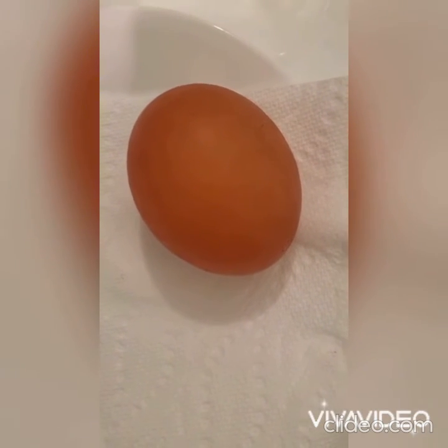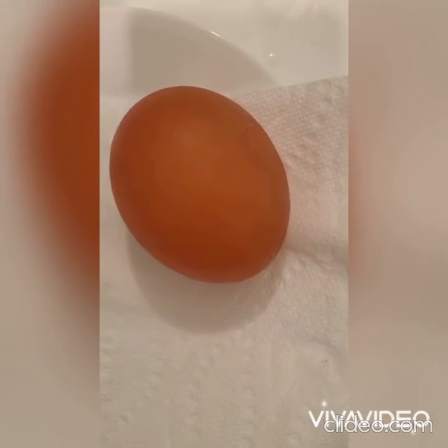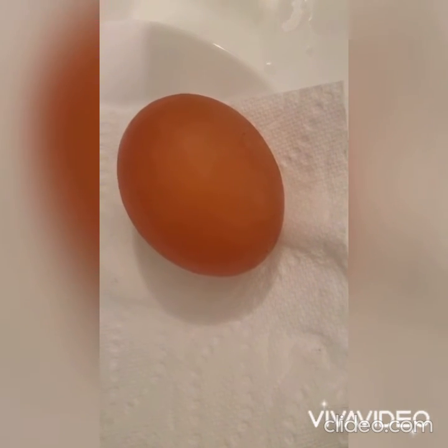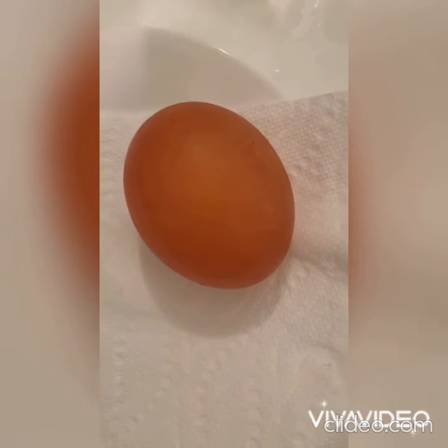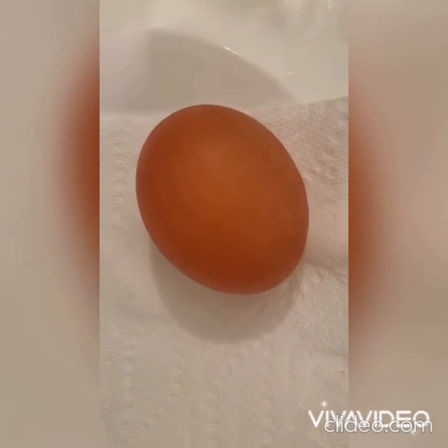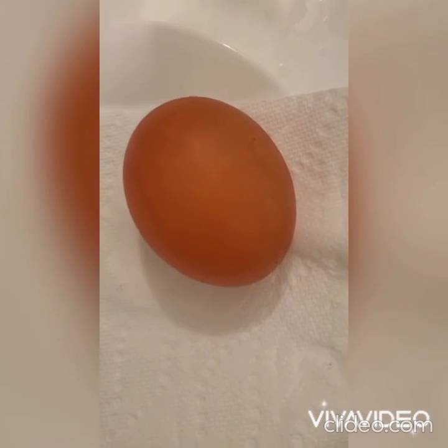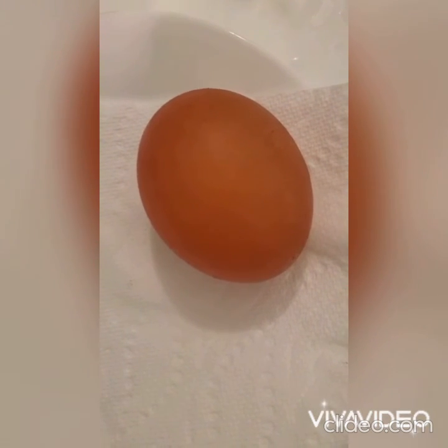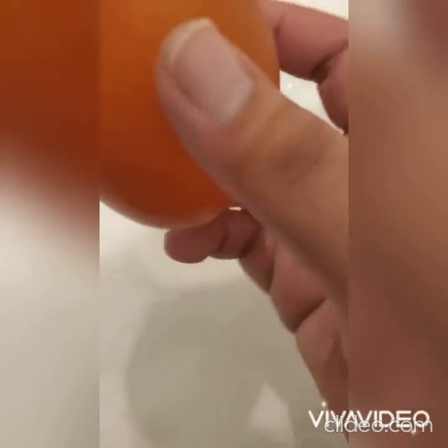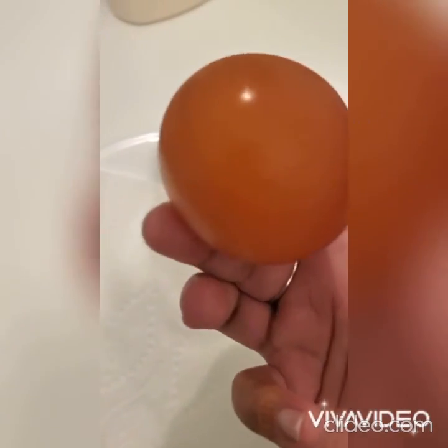However, since this is pure water, it formed a super hypotonic environment, causing an increase in the concentration gradient. The reason why the egg expanded is because water moved into the shriveled egg through osmosis. Since the water potential inside the egg was lower as compared to the water potential in the glass, the water moved from the glass into the egg to reach equilibrium, increasing the size, volume, and turgor pressure inside the egg. So here we can see this enlarged egg.